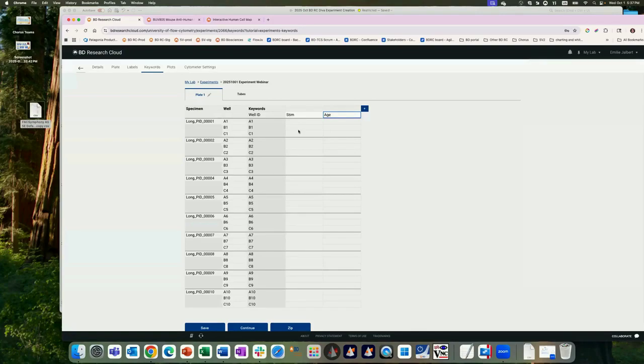So again, this works like a spreadsheet, so I can say no stim, and then a positive control. So then I can shift, copy, paste. I can select multiples at once and paste that, right? So it just makes the entry that much easier compared to having to add them one cell at a time in Diva.